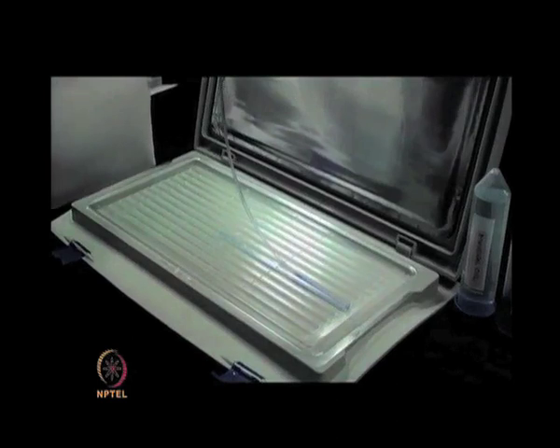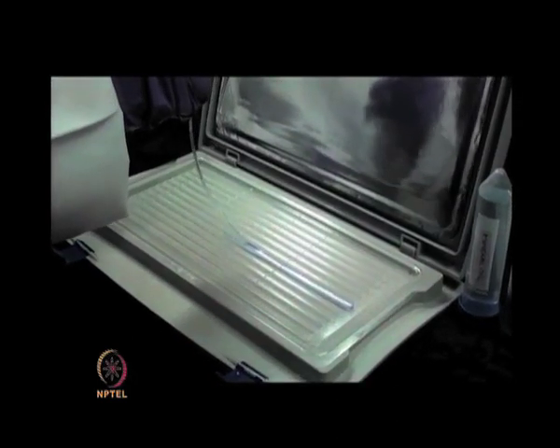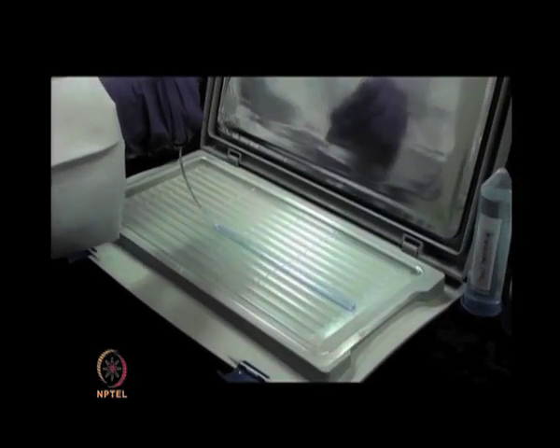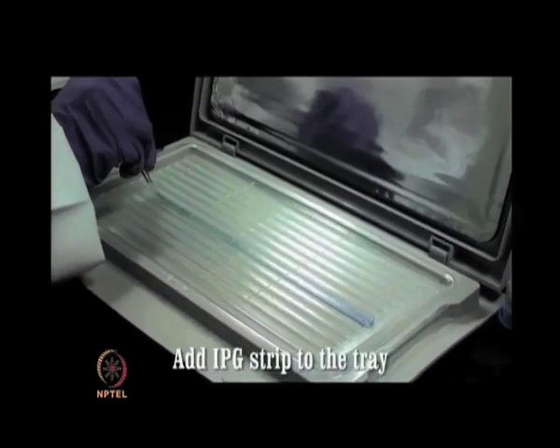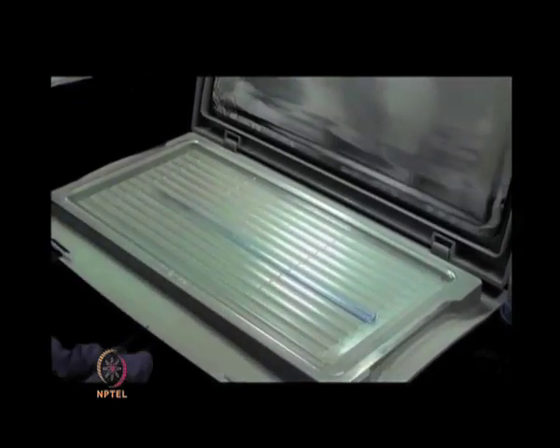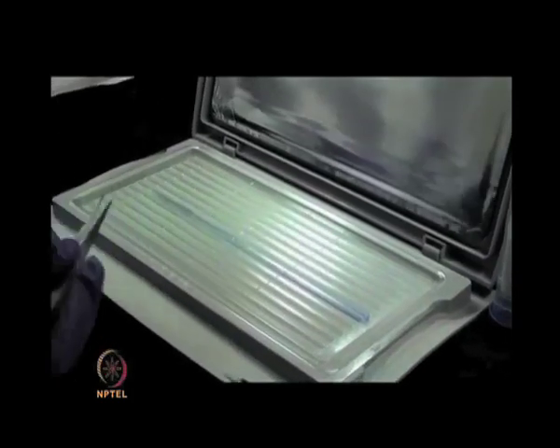IPG strips are used for separation of proteins based on their isoelectric point. These are acrylamide coated plastic strips containing immobilines of various pH spread across it. They have successfully replaced conventional tube gels due to the reproducibility they can achieve.